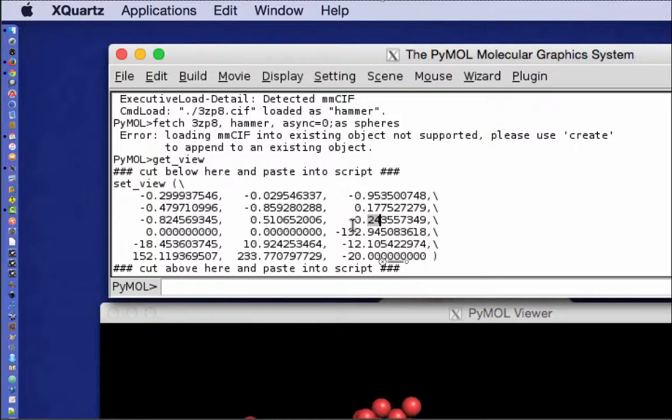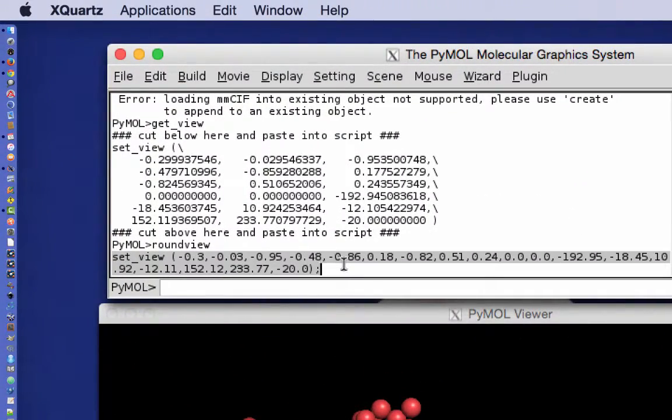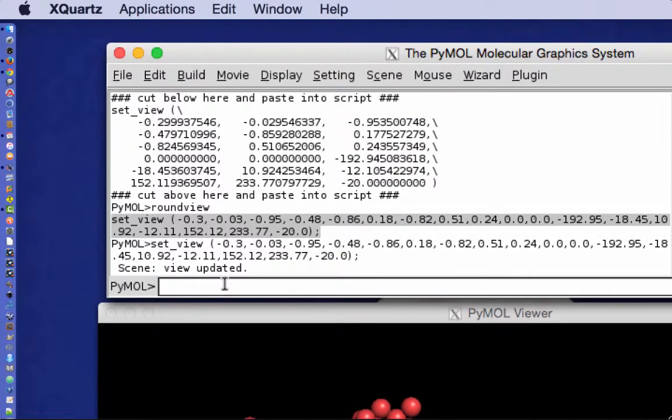The roundview.py script just contains a single function called roundview. It returns the settings in a compact format in one line. It's easy to select, copy, and paste these compact settings onto the command line. The compact settings can be added to other commands on the command line.